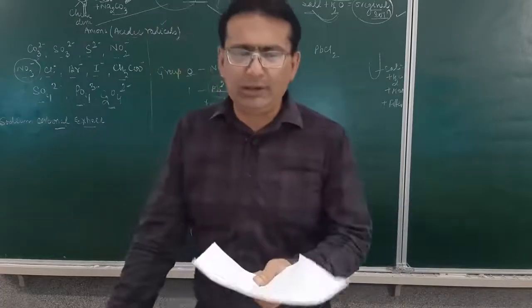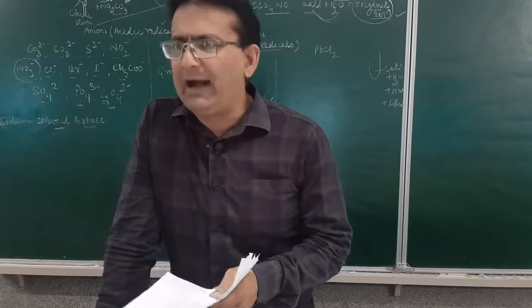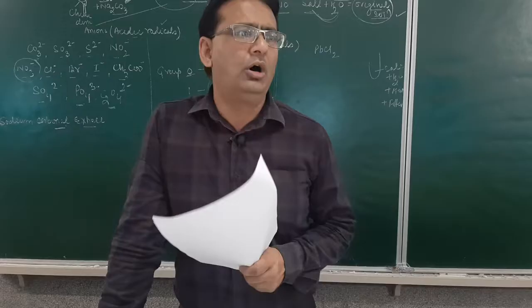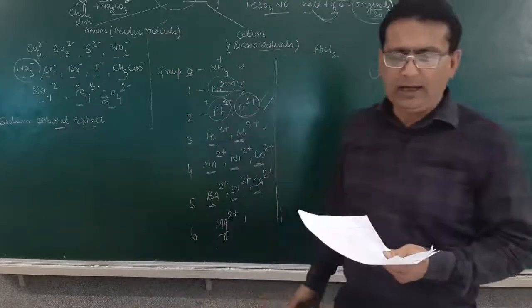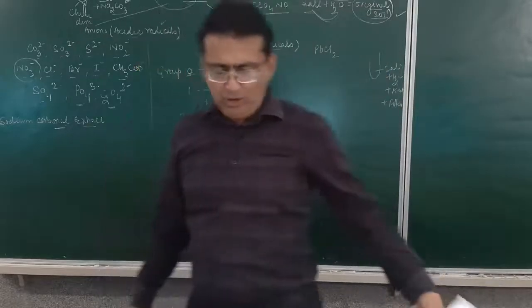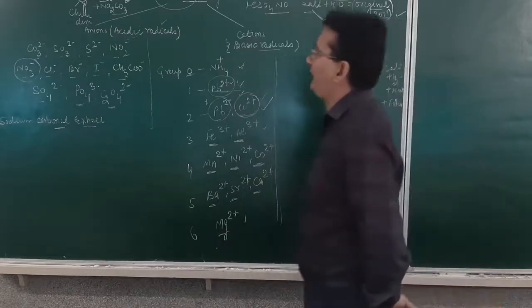In almost all the tests given in this study material to you, you will be identifying the anions by use of an aqueous solution or sodium carbonate extract. You may see after the aqueous solution, here it is given a sodium carbonate extract. Now, how to prepare a sodium carbonate extract? What you have to do?